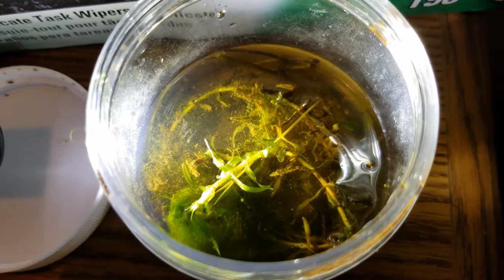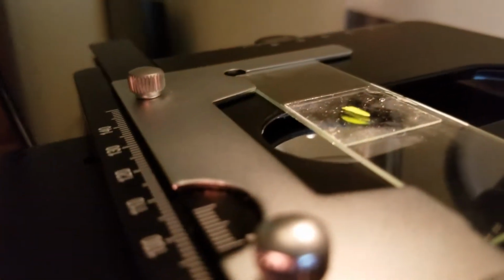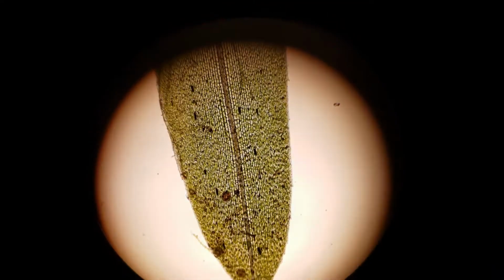Here's a small water plant that I found. Now I've taken a small clipping of it. You can see there. And I'm going to put the camera into the microscope. Let's take a look at it. Here is under 4 times.